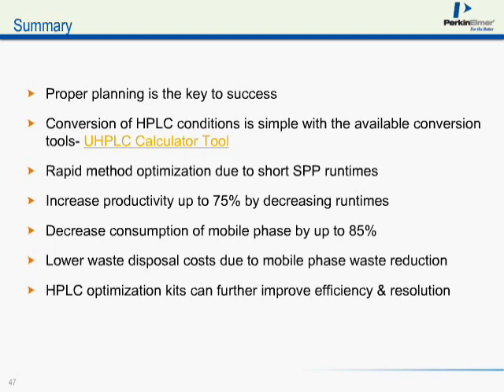First question comes from Julie. Her question is, let's say I already have a new UHPLC system and I've tried the sub 2 micron columns. I'm not happy with the lifetime of my columns. Can SPP still help me, and can I still use the calculator?